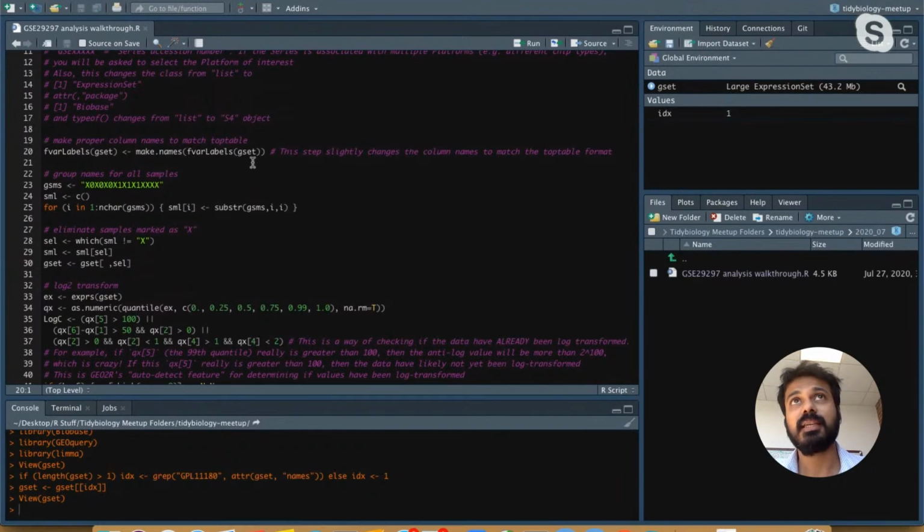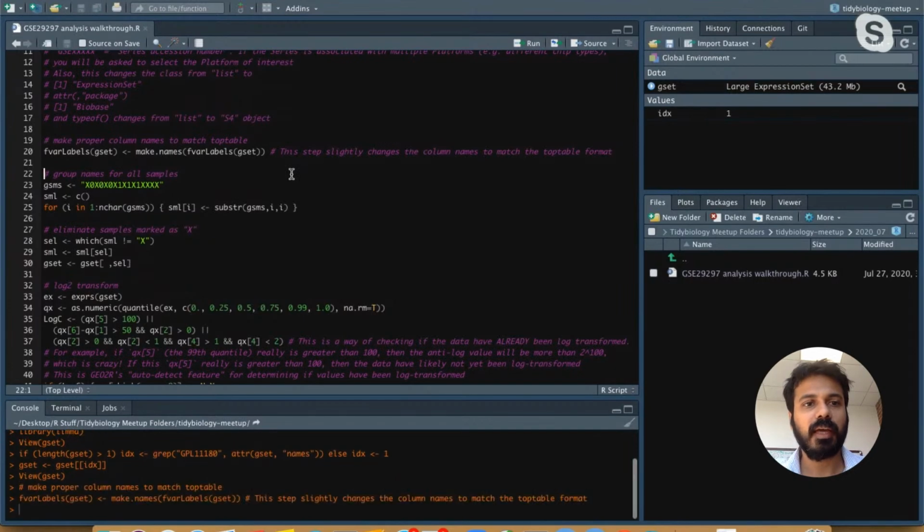And what it does is it imports a lot of the column names that are within your GSET dataset, or it makes those available for use later on. It'll include these names, these column names, into our final data output table, which is called the top table. So we'll go ahead and just run that.